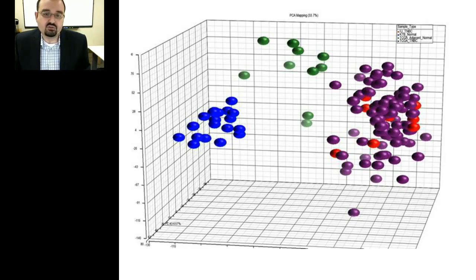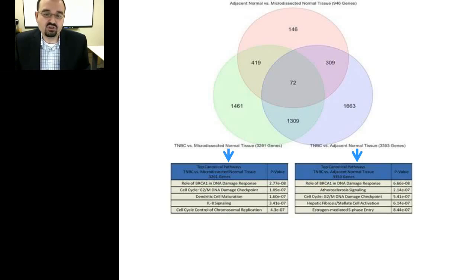As is also known, the majority cell type that makes up the normal breast consists of fibrous tissue, fat, and stroma, and we wanted to enrich for the RNA specific to this area that's the origin of breast cancer. What was neat was these are actual samples donated from healthy volunteers as part of the Susan G. Komen tissue bank, and were chosen from a larger bank of 1,500 normal breast tissues with matched serum, plasma, DNA, and a full medical history. And we were able to capture all that data in our analyses.